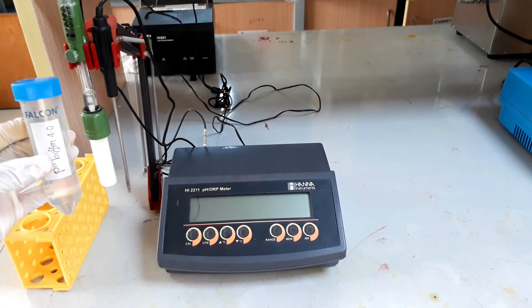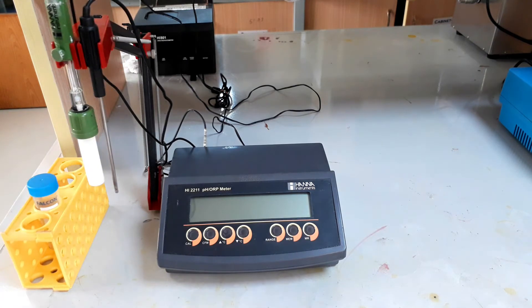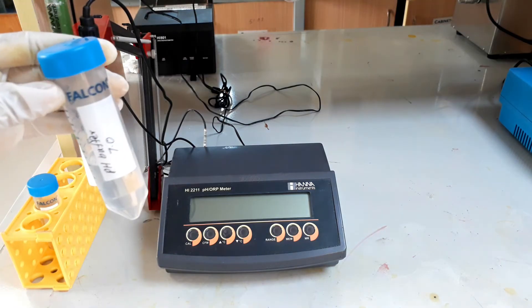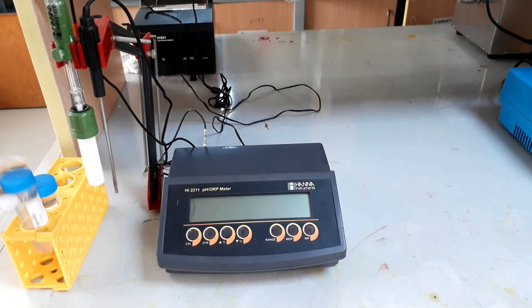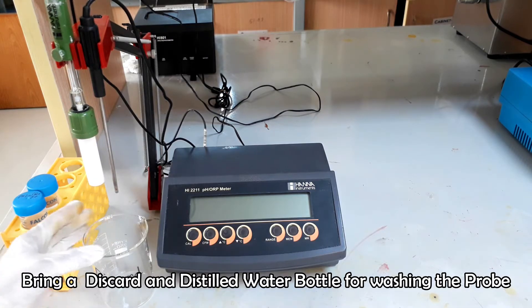First of all, we have to calibrate the pH meter against pH buffer 4 and buffer 7 solution. The discard beaker and a distilled water bottle are needed for washing purpose.